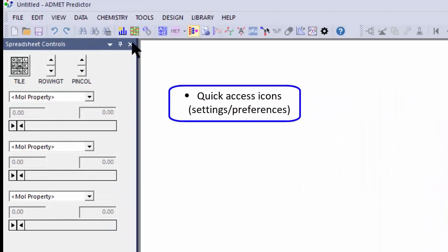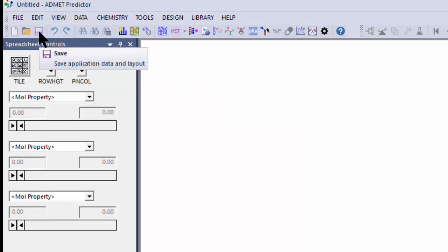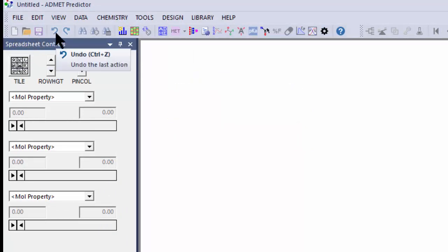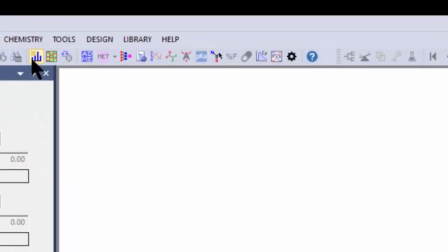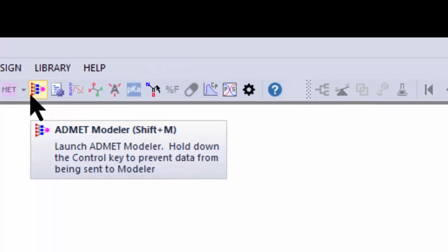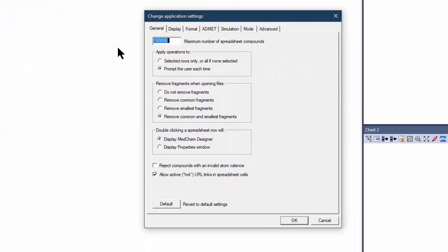Right below the pull-down menu are what I call the quick access icons. You have things like Open and Save, Undo and Redo — these two commands are pretty important as you're working with the program. We have things to find, build charts, open up ABAP Modeler, et cetera. The one I want to detail first is the Settings, which looks like a gear display here.